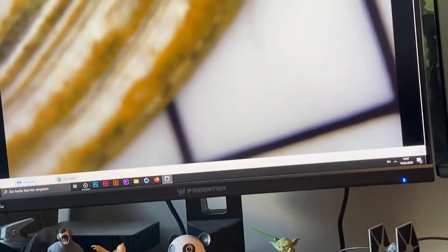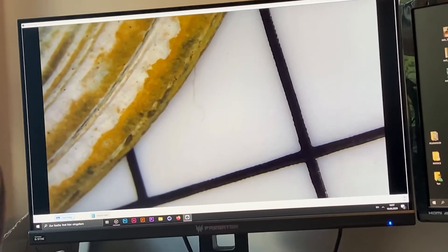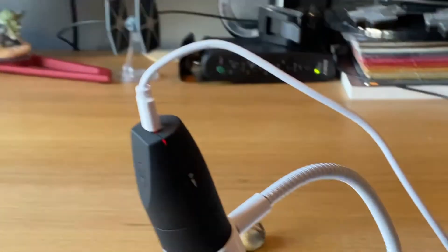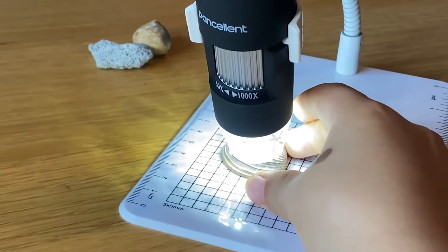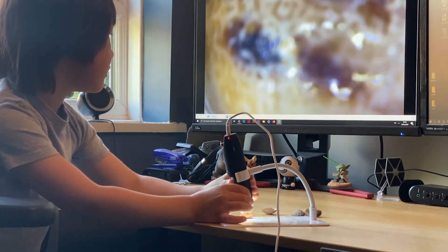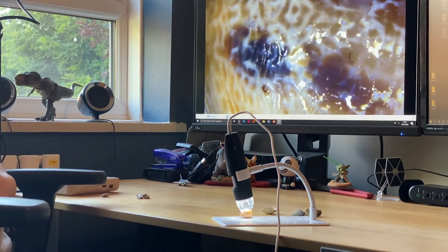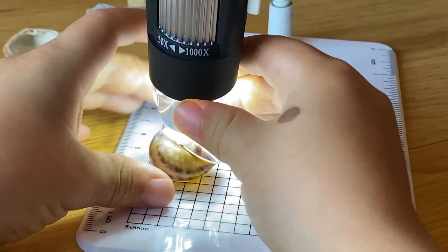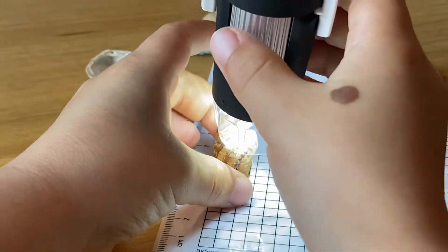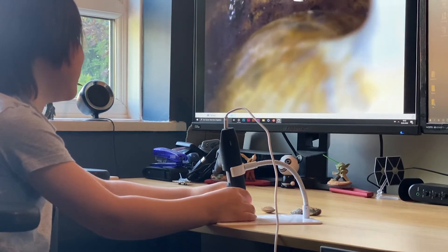It's definitely a cool thing to have around. It sits in the small box whenever you need it — you can take it out, and whenever you're outdoors somewhere and find a cool object, you bring it home. I had it several times that my son said, 'Oh, we should take this home to put it under the microscope.' Kids love it, and it really is done in a way that it's simple enough for them to nearly use it on their own. He's kind of doing all the work by himself, and it's really great to raise kids' curiosity.